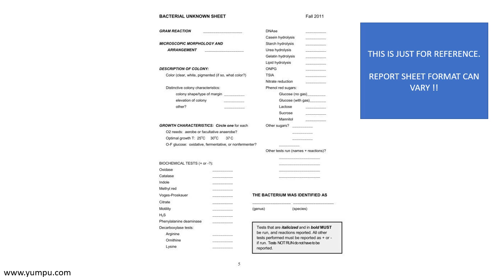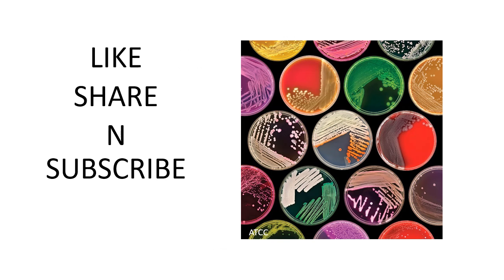You have to do some sequencing also. If you are doing research work, then you have to double check, cross check your results by doing a molecular study. That's another way of identifying your culture. And so this was all about identification of an unknown bacterial culture, and I hope you now have a clear approach of how to proceed and what to do.